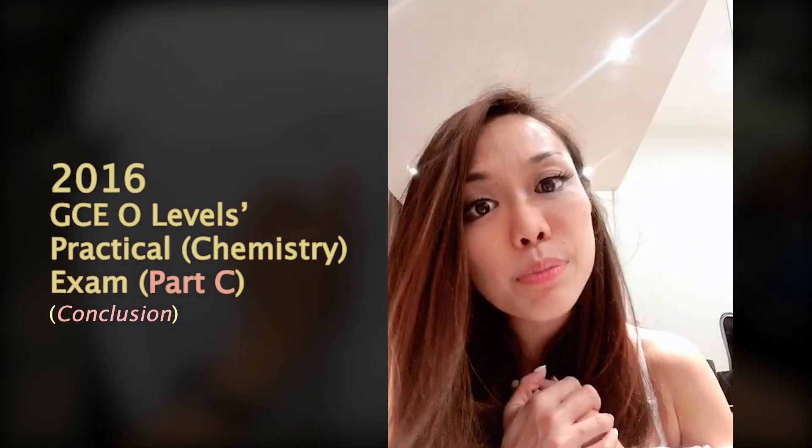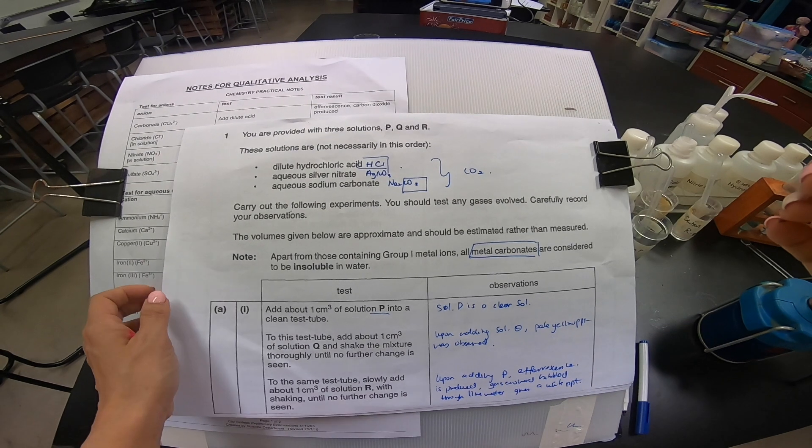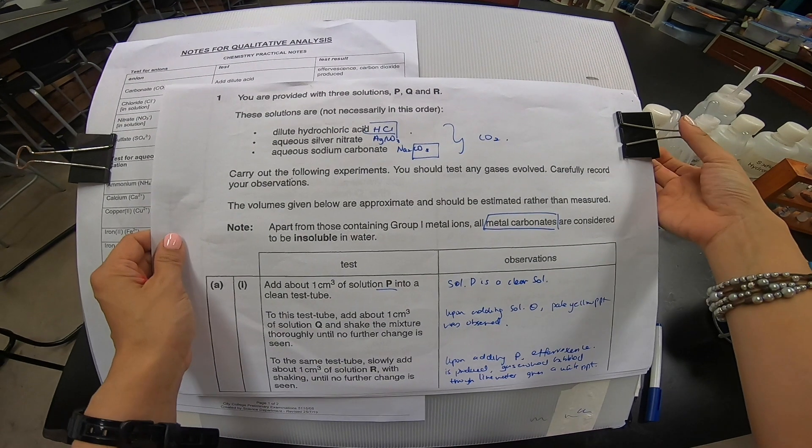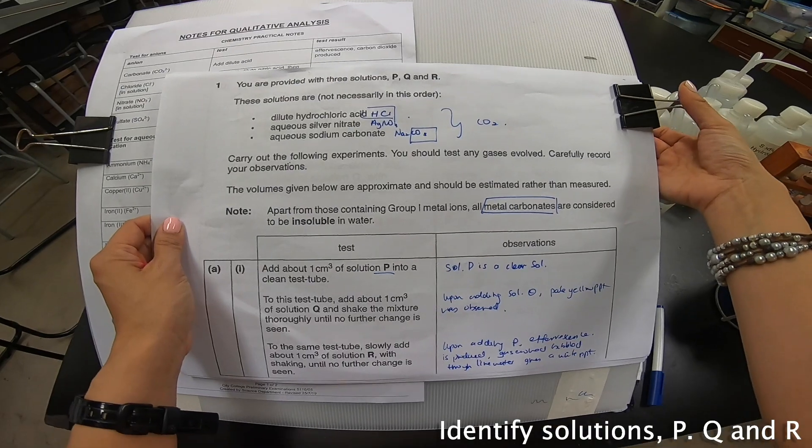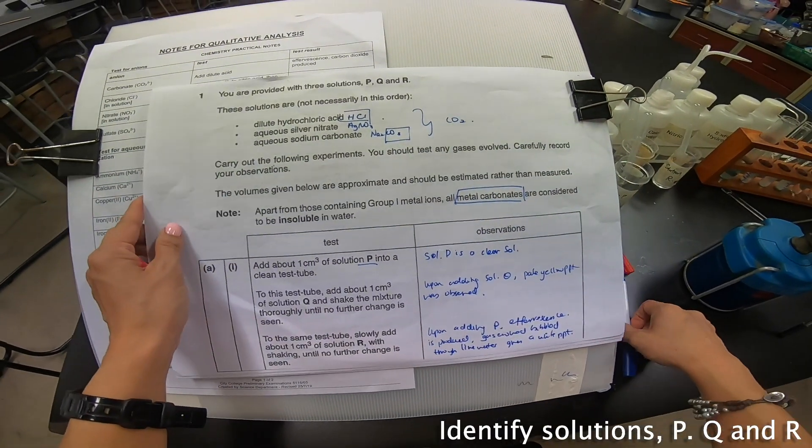So this portion, there's a lot of theory that are involved, but please stay with me because through the explanation, you are going to have a better understanding of how come they are the solution. All right, we come to the last part, which we need to identify who on earth is P and who on earth is Q and R. So let's begin.